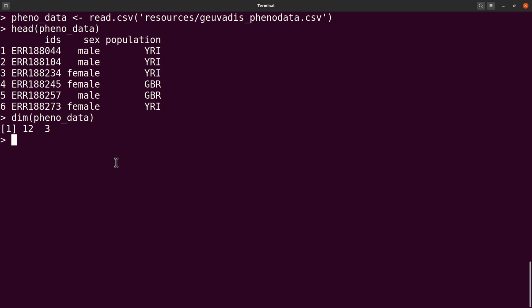Now it's time to load the expression data using BALLGOWN. We already have it in the abundance directory, so we will load it here. So we say bg underscore chr x, and then the assignment operator for R. So we have it this way, and we say BALLGOWN, and we specify the data there where that particular expression data is located. So it's located here in the abundance directory.